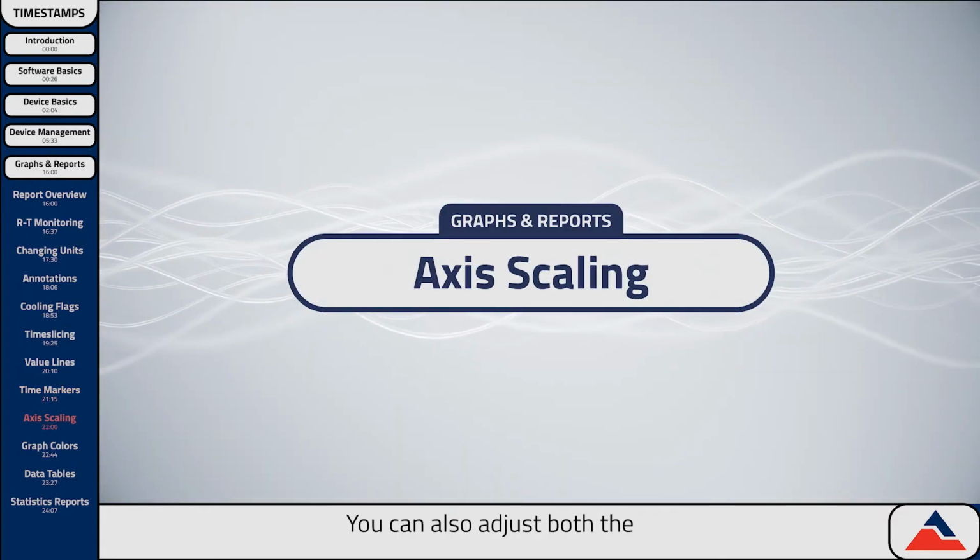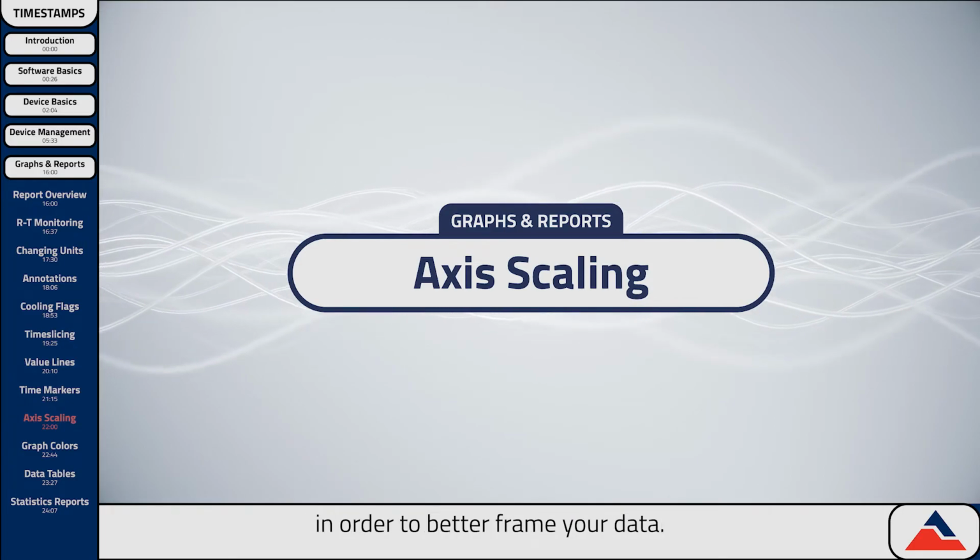You can also adjust both the vertical and horizontal scales of your graph in order to better frame your data.